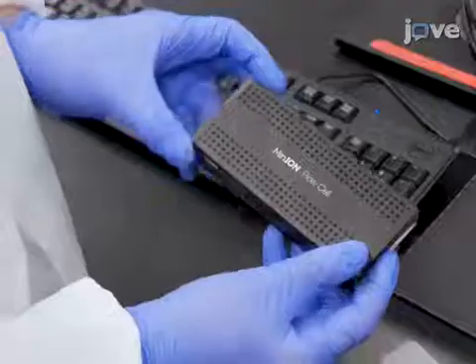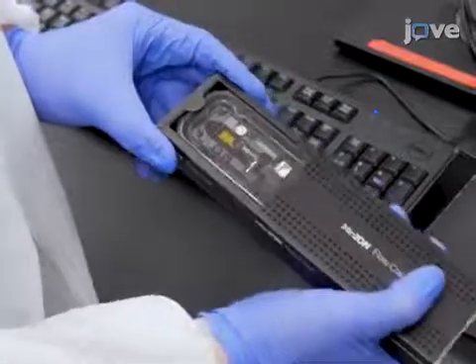The technique is affordable and requires minimal laboratory equipment. This technique also gives students the opportunity to use more sophisticated bioinformatics tools than are usually available in laboratory classes.